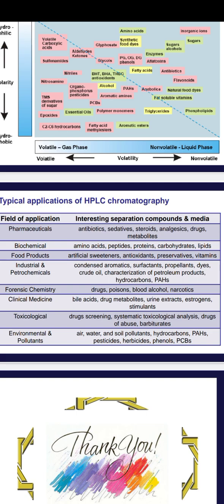In industrial applications: petrochemicals, condensed aromatics, surfactants, propellants, dyes, crude oil, characterization of petroleum products, hydrocarbons. Forensic chemistry: drugs, poisons, blood alcohol, and narcotics. Clinical medicine: bile acids, drug metabolites, urine extracts, estrogens, and stimulants. Toxicology: drug screening, systematic toxicological analysis. And environmental pollution.